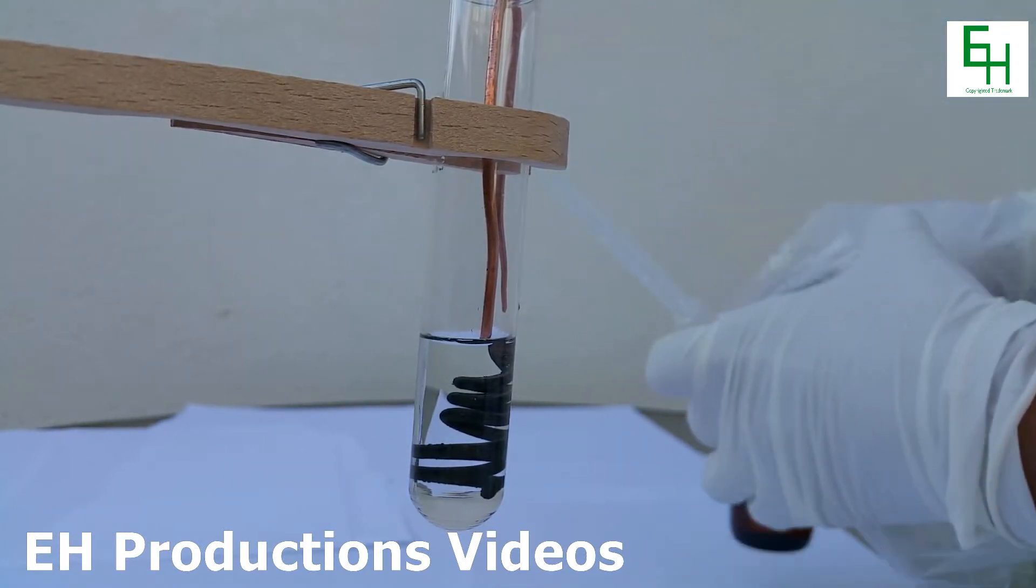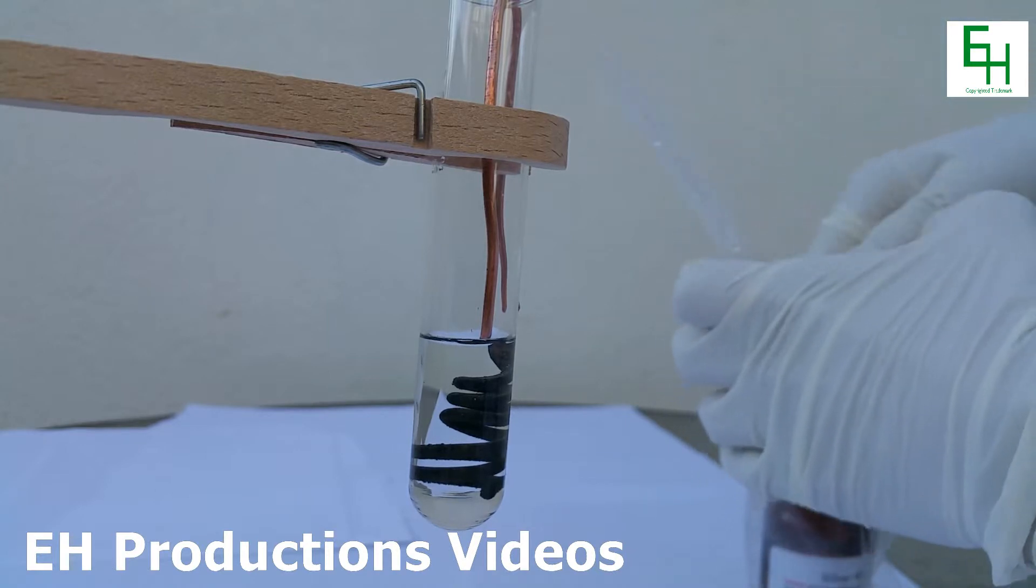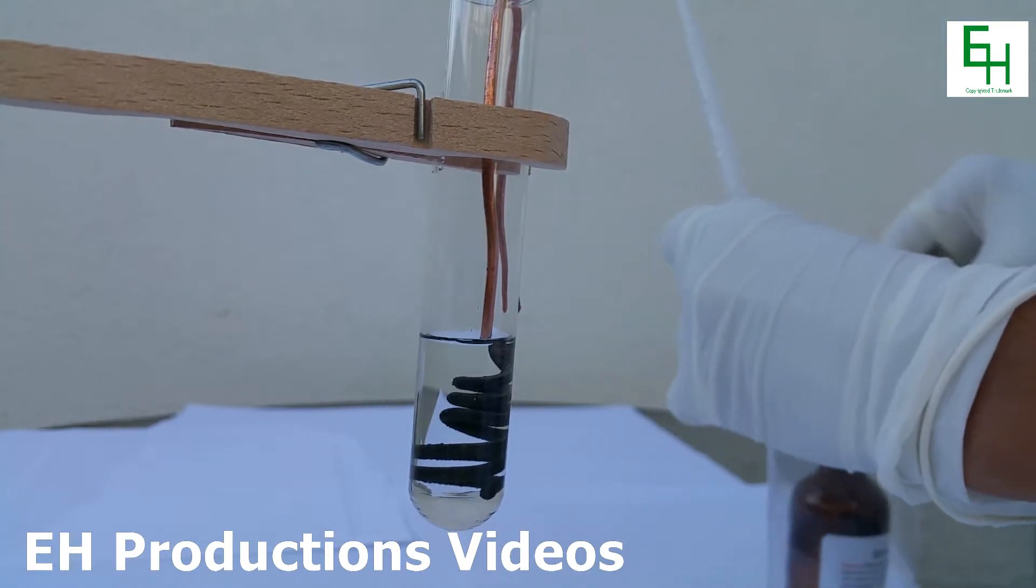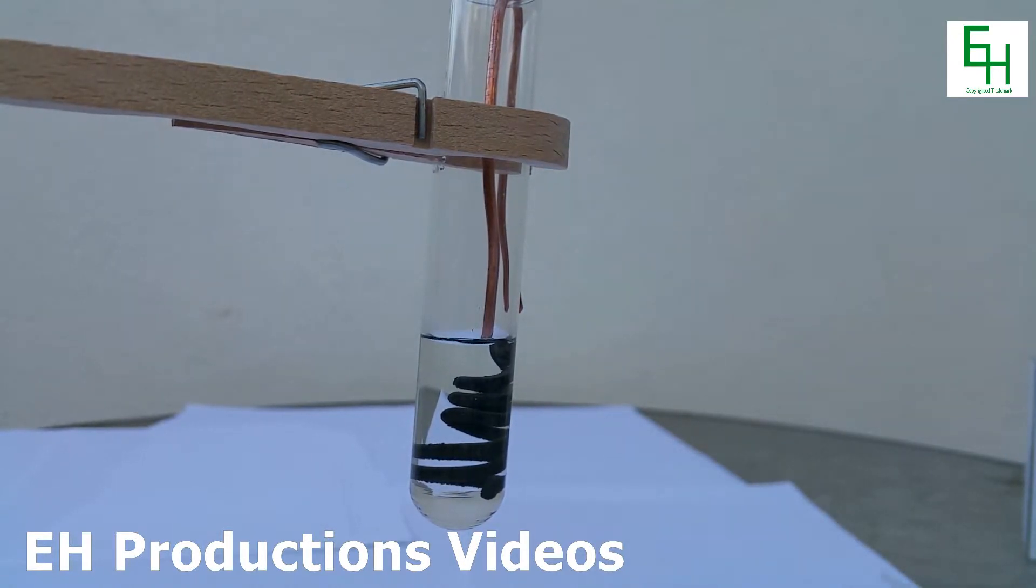I'm going to put it back. You can see that there are crystals growing on top of the copper, and that is actually silver. That is pure silver growing on top of the copper wire. So I'm going to let that stand for a while.